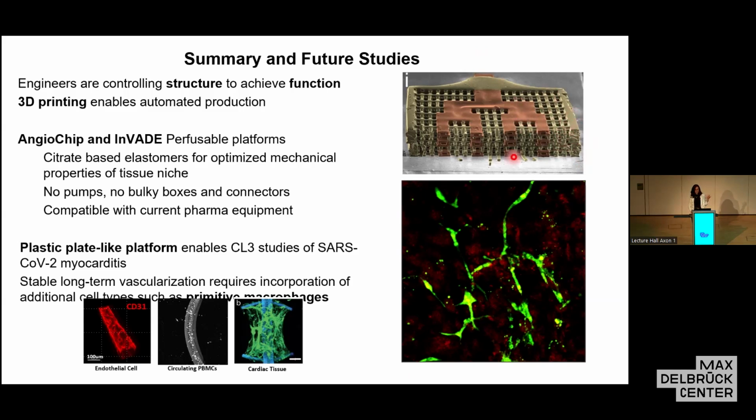But I'm not optimistic that we can now make the whole big human-sized heart tissue with this yet. But I think we're going in the right direction. We have all the ingredients in terms of stabilizing the microvasculature and doing the branching. I think vascularization is a perfect problem. You can spend your entire career working on it.